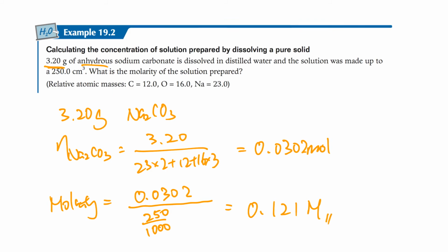At the end, you have to use the mass that you weighed on the electronic balance and do the following steps to find out the molarity of your standard solution. Remember, everyone's standard solution will be different, so their titration results will also be different. Say for example, student A uses 20 cm³, while student B does not necessarily use 20 cm³, they may use 20.5 cm³. So that is how we prepare a standard solution.